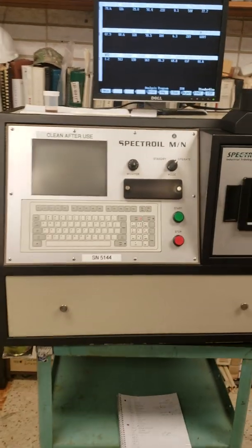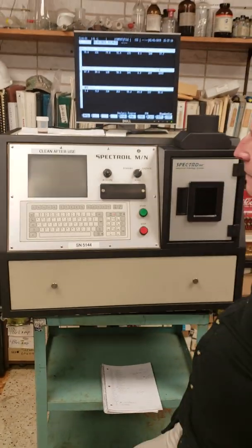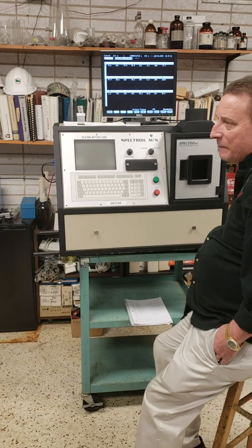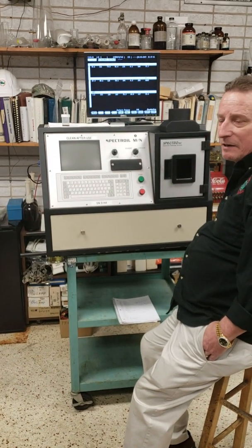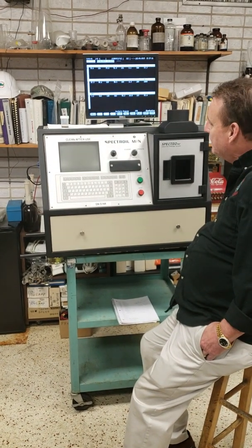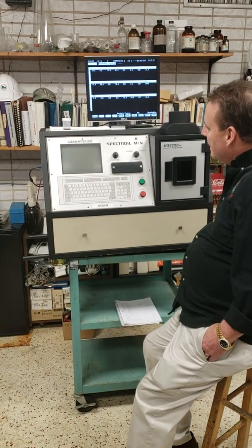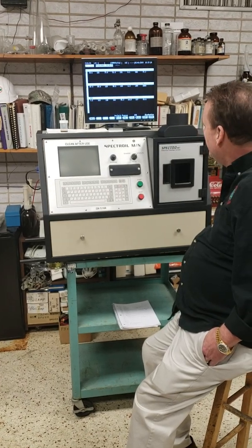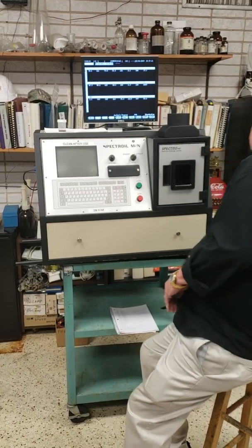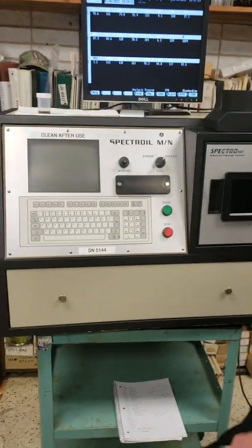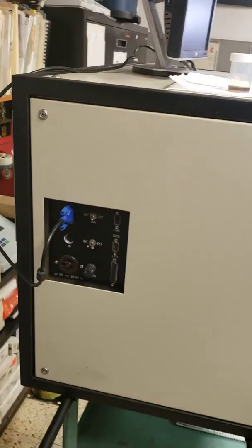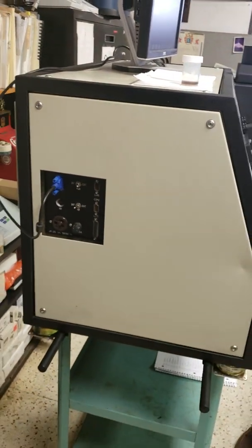This is an older machine. These were made by the army — they made them to be deployable so they could carry them out in the field. This machine is probably from 1994. So it's a pretty old machine, but they're real durable and they're made well.